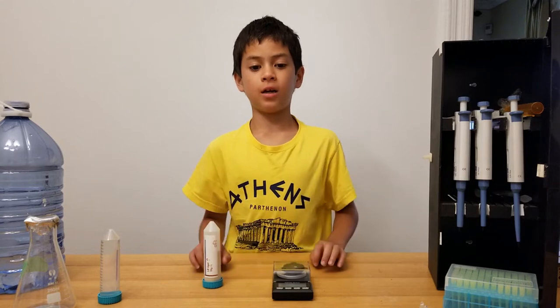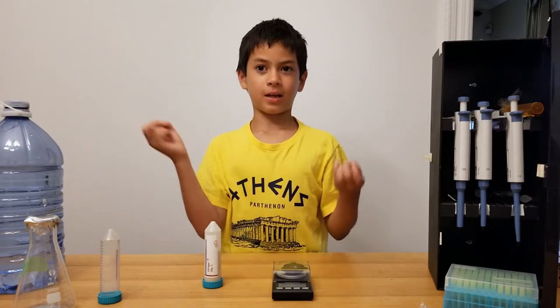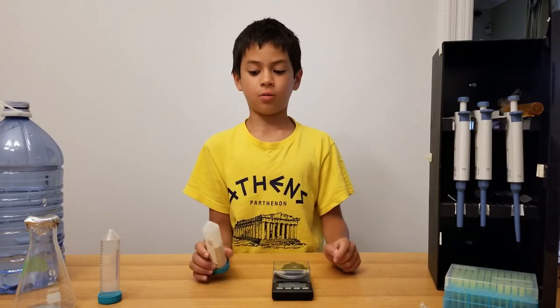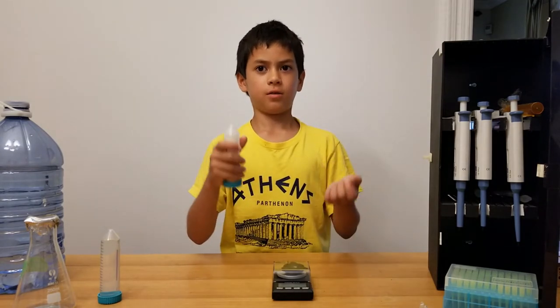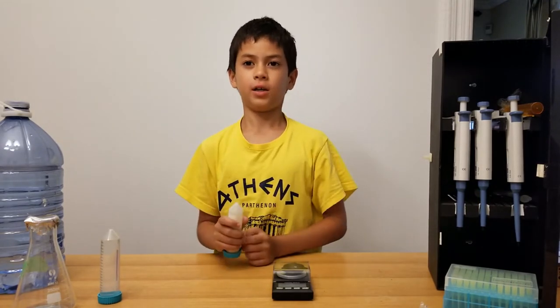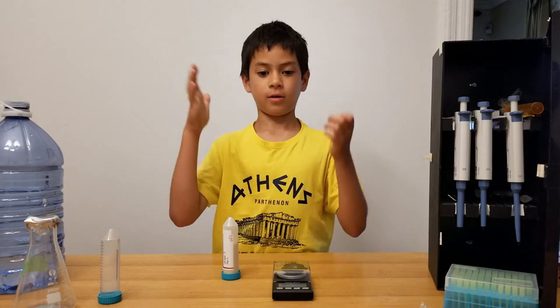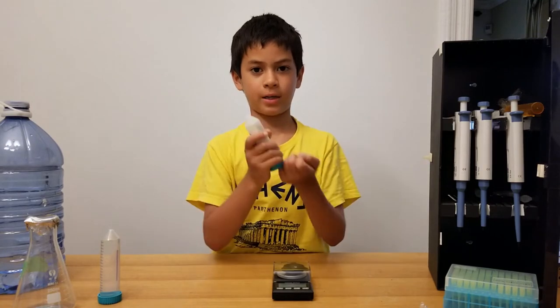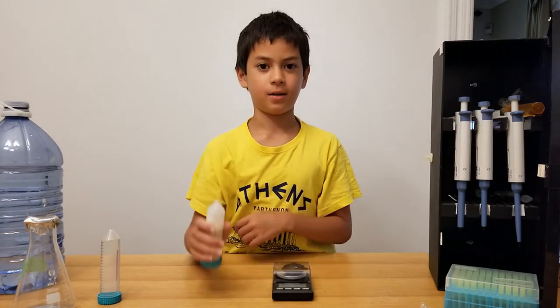We're gonna start making the food we need to grow the bacteria. We're gonna start with something called LB, but we're gonna use LB agar — which is LB combined with agar so it doesn't spill everywhere. We'll do another video about just LB. By the way, the bacteria does not eat the agar — it only eats the LB.